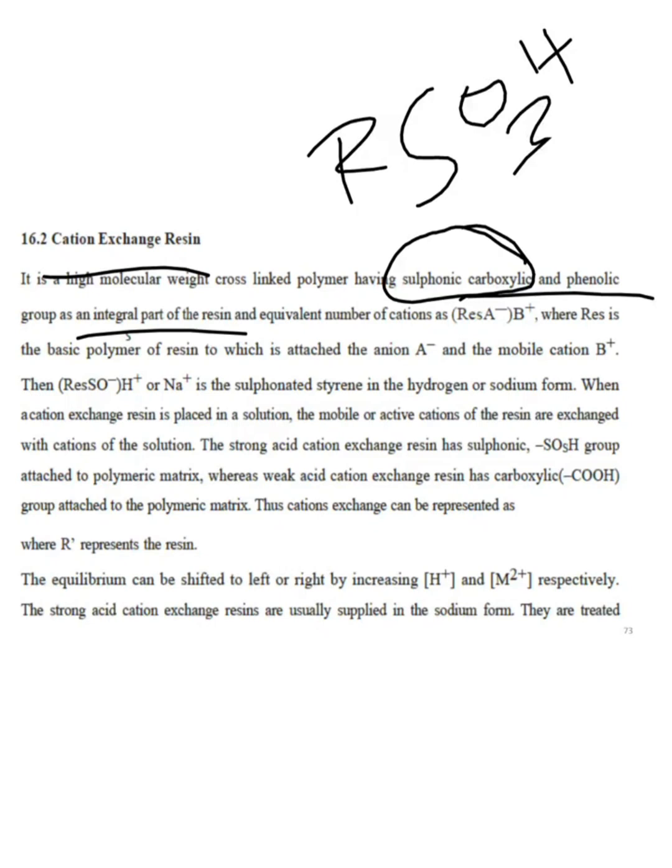So here, mobile phase, if you take an example, I will show you in the example, you will know easily. This is the column.